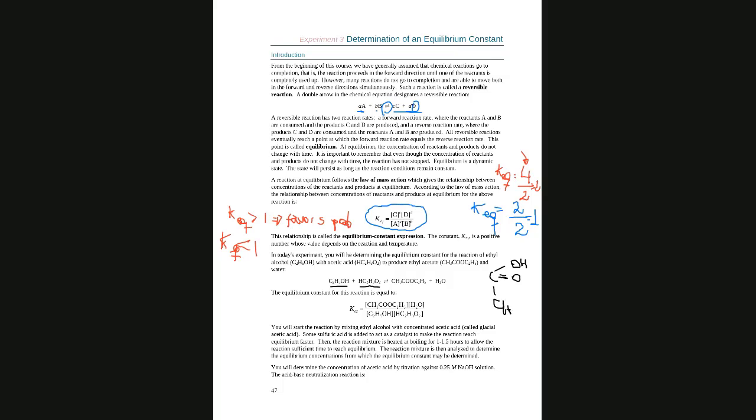This is acetic acid. I will give you in this way, only because I want you to see that this hydrogen is the acetic acid. So you will titrate this. This is the one that is going to leave. Acids release hydrogen. An acetic acid only has one proton to release. And that's what you are going to use in the titration with sodium hydroxide.